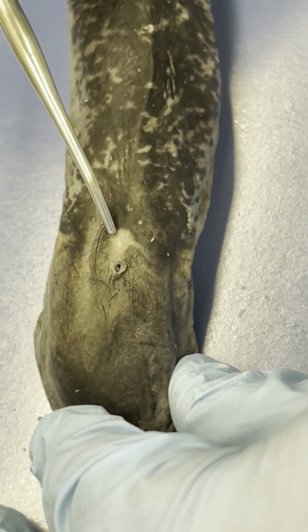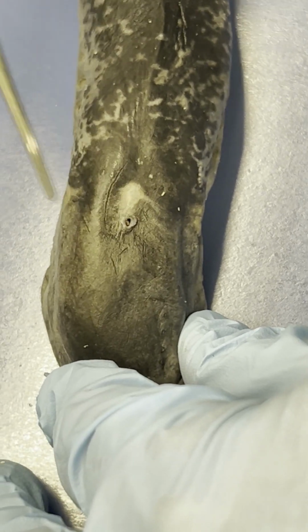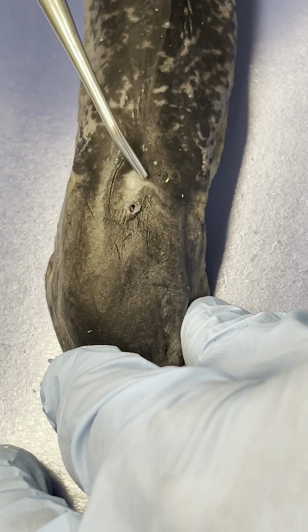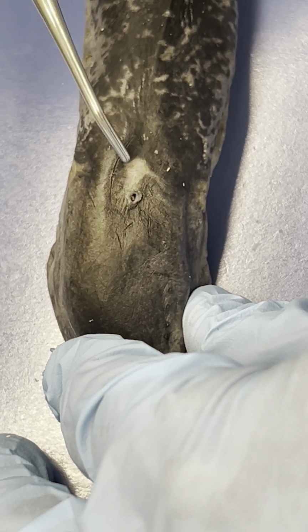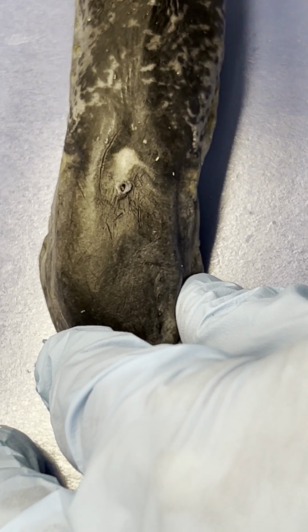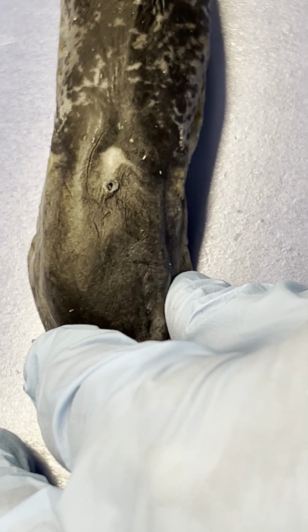Every lamprey, you're going to also see this white area right behind its nasohypophyseal opening. And this more or less is its pineal gland. And I want you guys to look up what is the function of a pineal gland in general, but also specifically to the lamprey, okay?